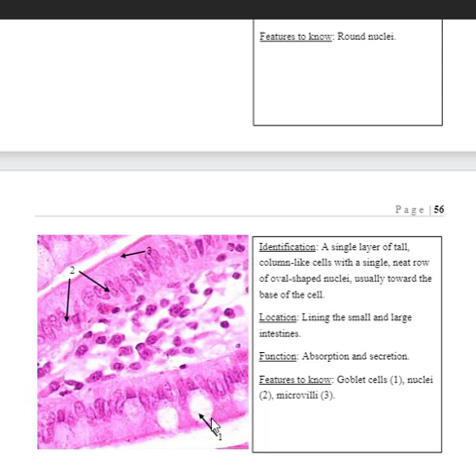So these right here are called goblet cells. So I think maybe the person who named it might have been drinking at the time, because that doesn't look like any goblet that I ever drank out of. But anyway, if you see one that's clear looking, it's full of mucus. So mucus, we use other words like phlegm and snot and things like that for mucus. But anyway, so this is a goblet cell that's making mucus.